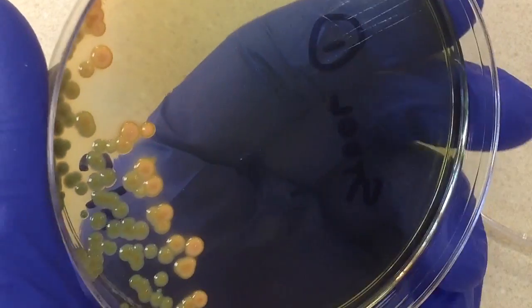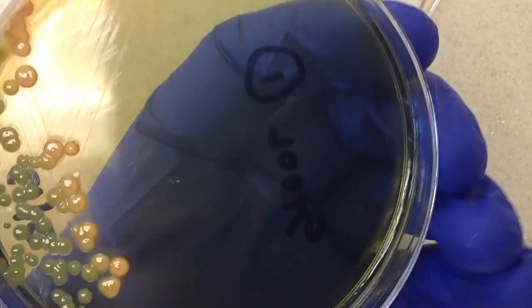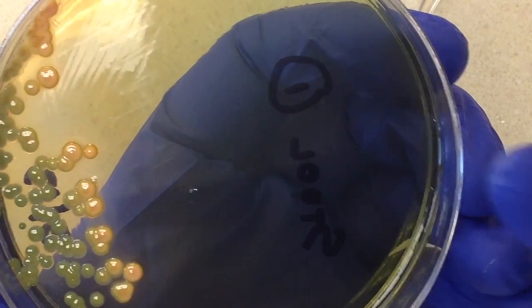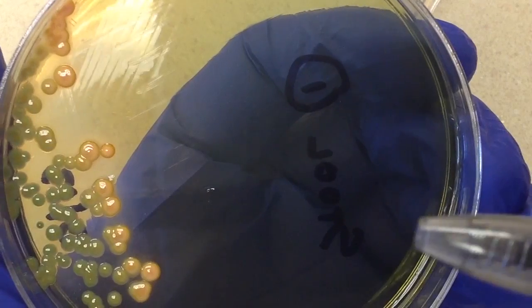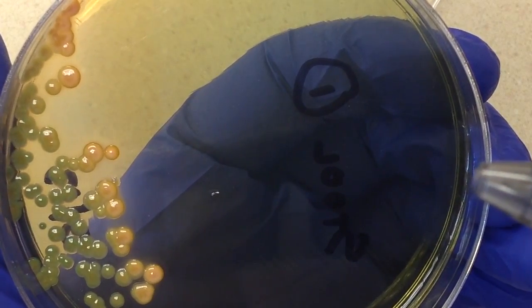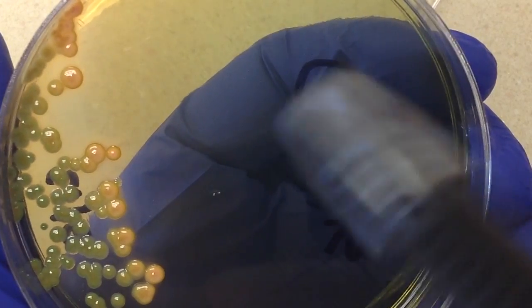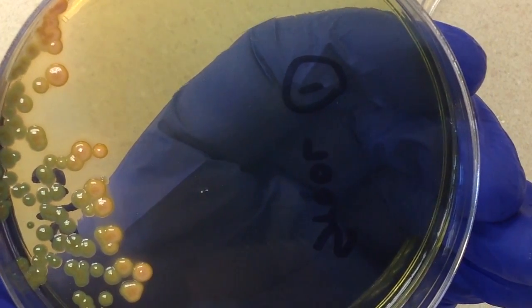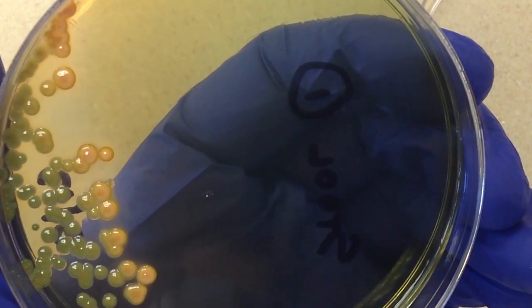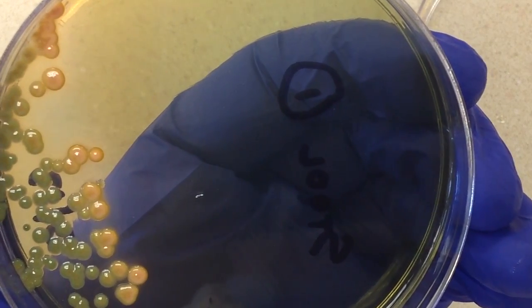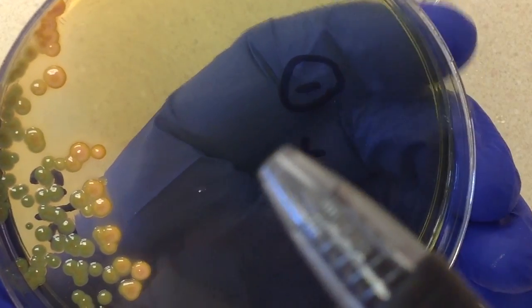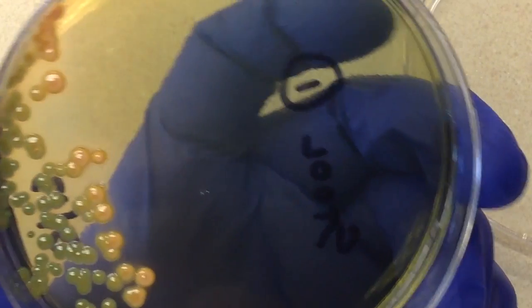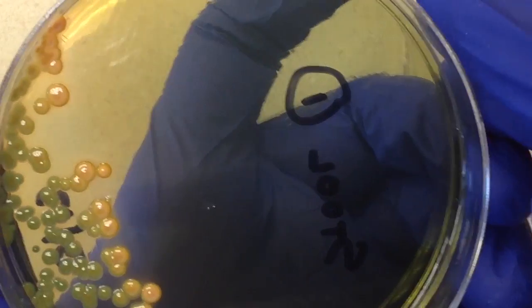I kind of forgot to mention, the other differential feature of this plate is if the organism produces H2S or hydrogen sulfide, we would have black colonies, colonies with black centers. We tend to associate just clear colonies with Shigella on this plate, but if we have ones that are H2S positive and have a black center, we tend to associate those with Salmonella. If you have any colonies on the hectone enteric plate that are clear, or if they have black centers, you need to work those up.